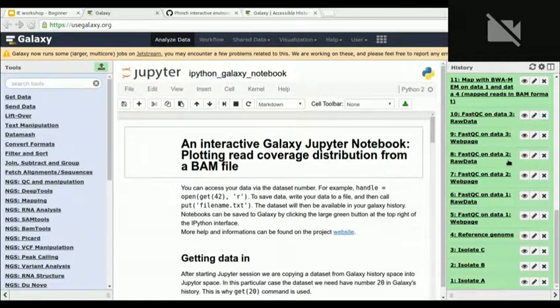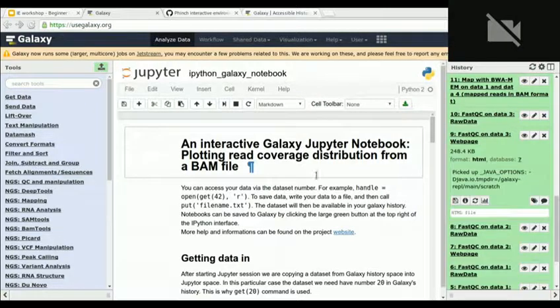I represent the not very sophisticated biologist kind of distribution. So I'm not that complicated. What I was doing here, when I wrote something like this, I will restart the kernel and erase everything. So, start.